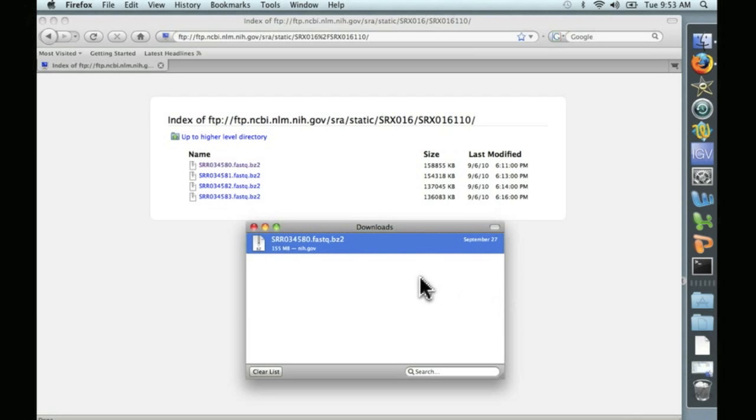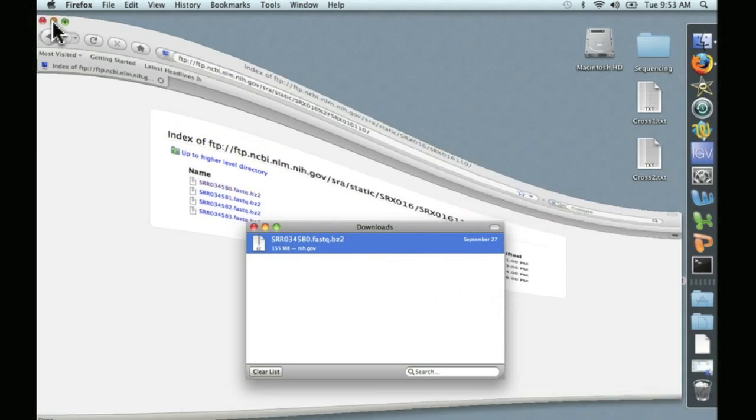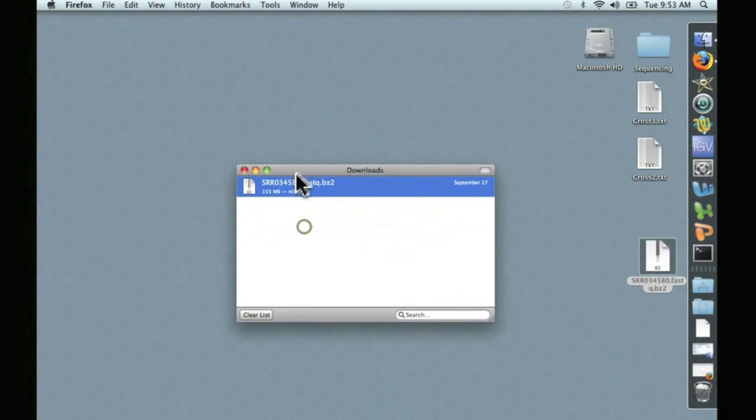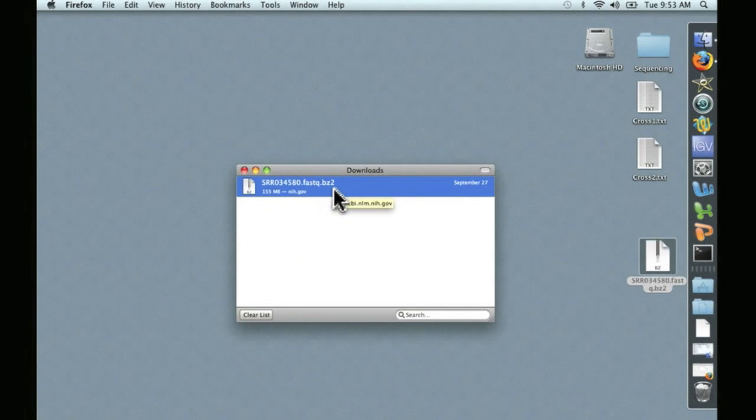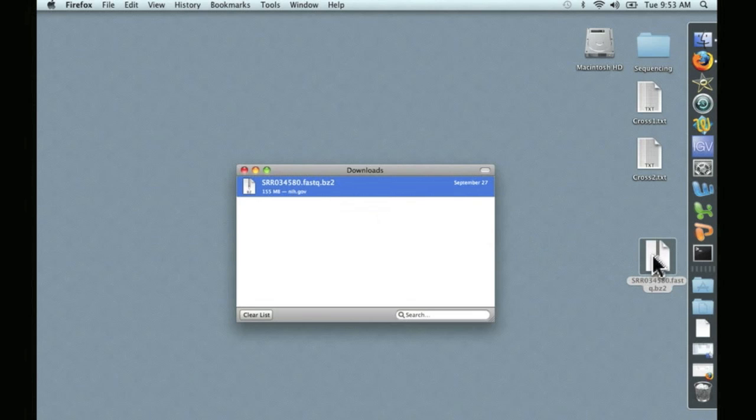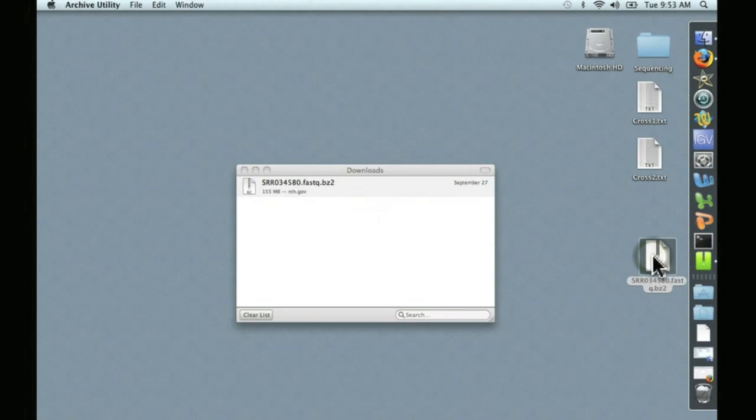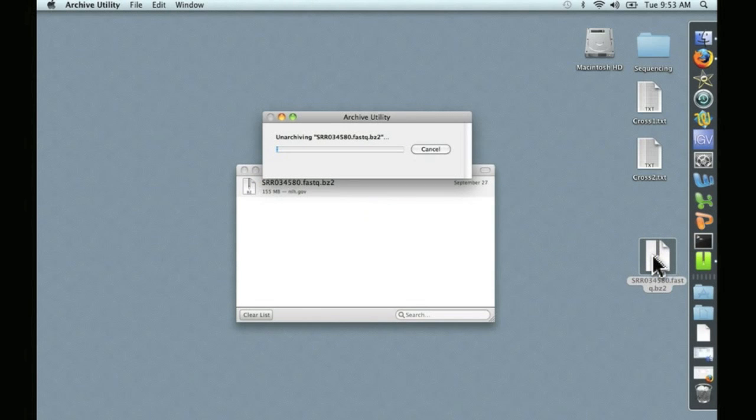And that's all finished, so let's take a look. This file was compressed using BZ compression. According to Galaxy, you can upload this file to Galaxy and it will automatically decompress it. However, I've never gotten that to work. So let's go ahead and decompress it here. Just double click. And now it's decompressing the file, and we'll upload the decompressed file to Galaxy.